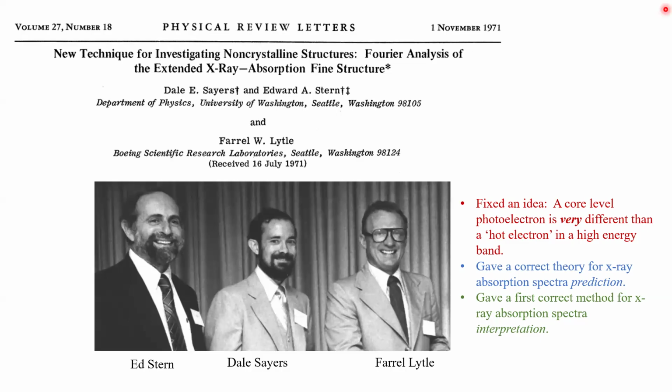Today we're going to discuss the history and future of X-ray absorption spectroscopy. The motivation for why I prepared this talk was it being roughly the 50th anniversary of this paper. This is a paper by Sayers, Stern, and Lytle. Ed Stern was a former late senior colleague at the University of Washington. And it's really a fascinating paper.